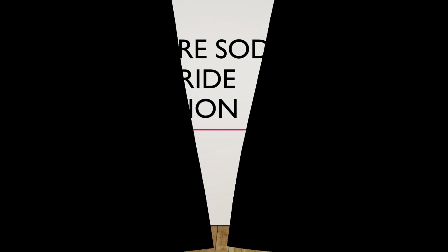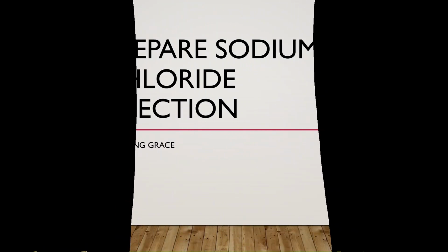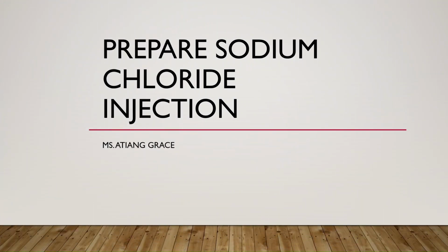Today we shall take you through how we can prepare sodium chloride injection. Preparing sodium chloride solution.